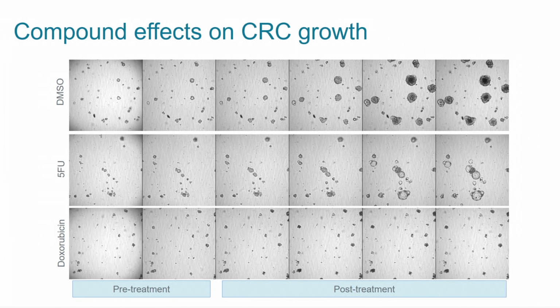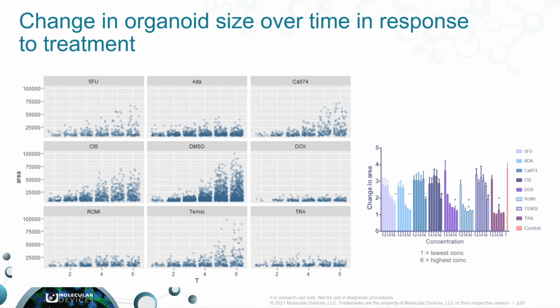And let's see, next slide here. And because it's an image-based approach, we're able to also get object-level data.